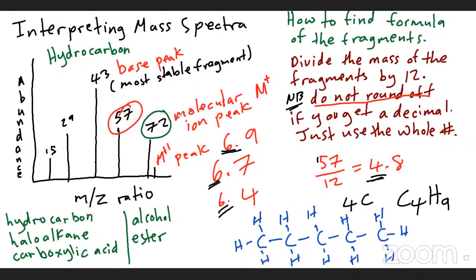However, if it fragments, let's say fragments here, you're breaking the carbon to carbon bond, right? So at no point would it have the correct amount of hydrogen to make it an alkane. Because you're breaking the carbon to carbon bond here, it will always have 1 less hydrogen. So for example, if you have an alkane with 3 carbons, it should have 8 hydrogens.